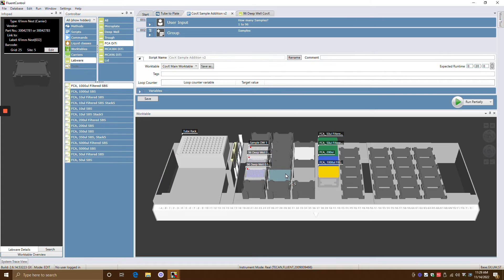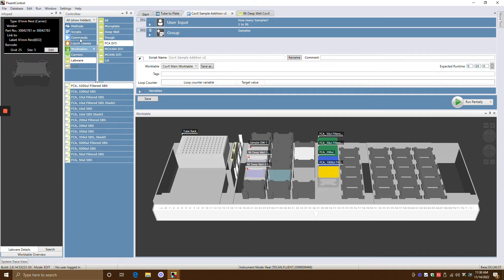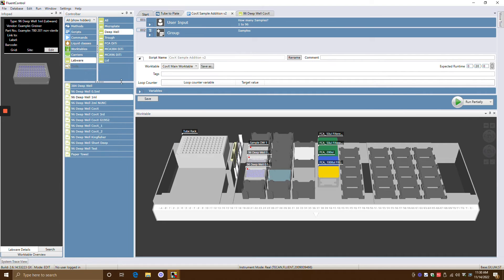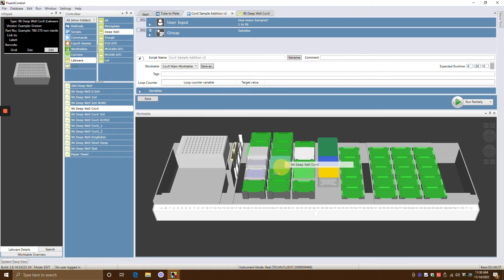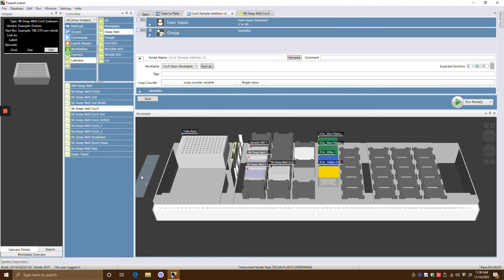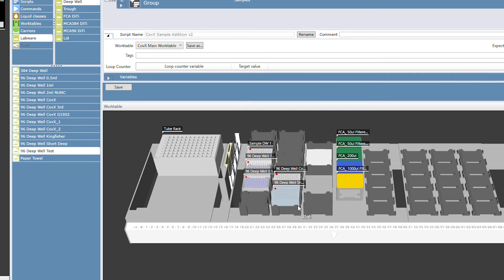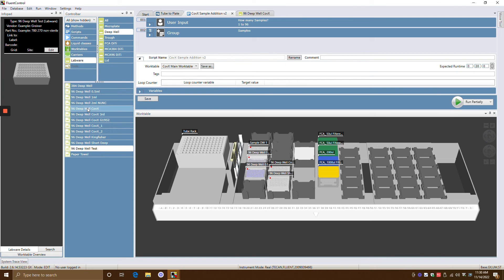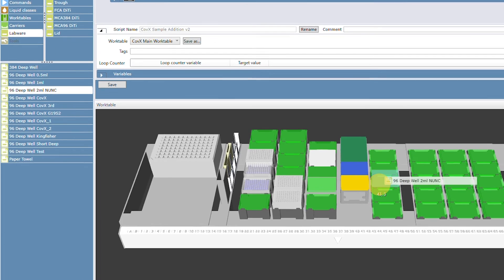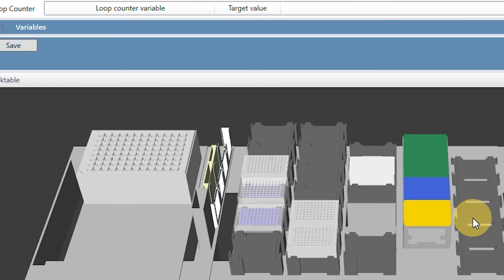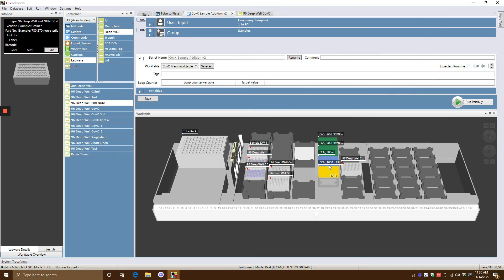So say for example, I'm on a carrier, it will show me the types of labware that I can put on it. So for example, if I wanted to put deep wells on it, then I can just simply drag and drop, right? See? Just drag and drop. Just drag and drop.